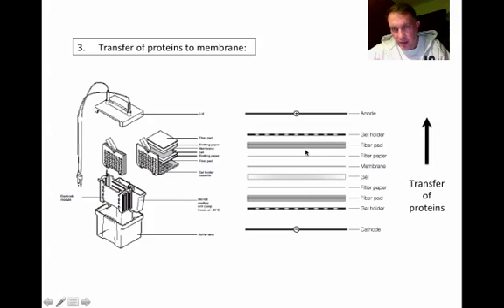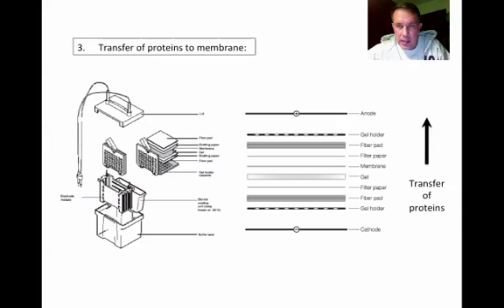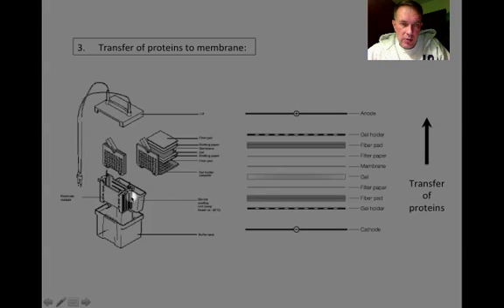In this sandwich, there are fiber pads on the top and the bottom, and filter paper that helps in the transfer by keeping the charge even and keeping the whole sample wet. The gel sits in the middle, and the membrane lays right on top of the gel, allowing the transfer of proteins. Once we squish it all together and stick it in the electrophoresis chamber, we run the current going across the gel — as opposed to the up-and-down direction we've used before.